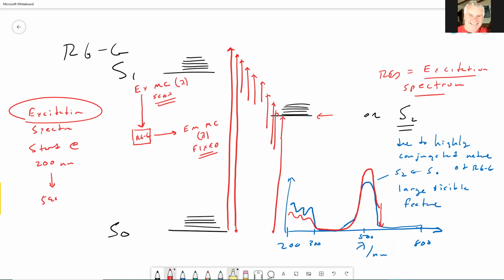So I said, well, why do they look the same? Well, what happens is that I'm going to make a little space for myself here, eliminate some of these lines. Let's say we can start at the very beginning wavelength, right?